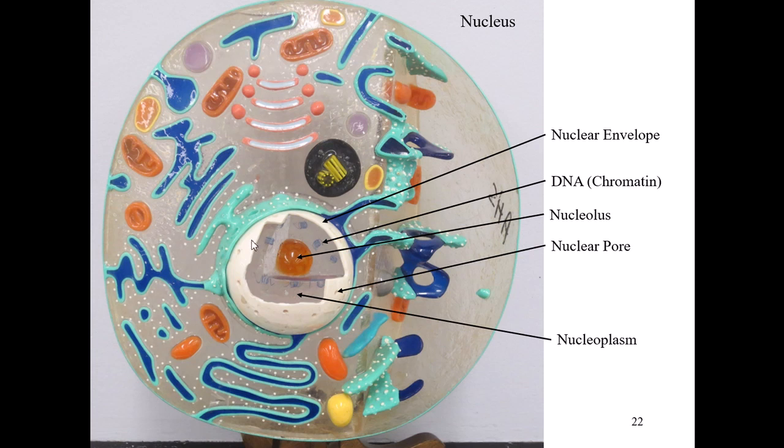So again, nuclear envelope, nuclear pore, nucleoplasm, nucleolus, DNA, or chromatin. I may have put in your notes nucleoli. That would just be plural. Sometimes it could be two nucleoli. Nucleolus would be singular.